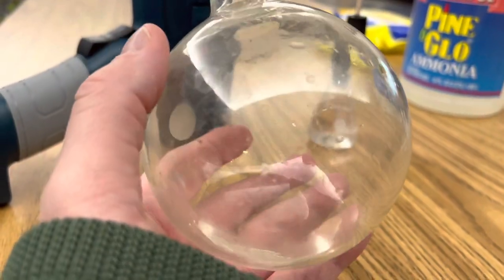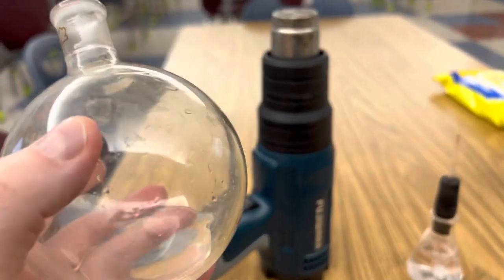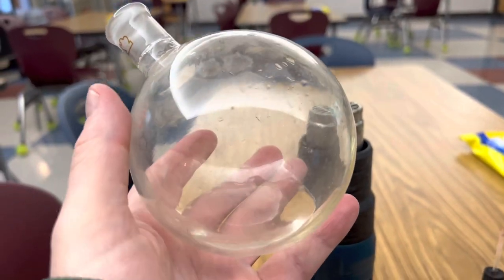The next step is to add a little bit of ammonia to your second flask and start to heat it over your heat source — whether it's a Bunsen burner, I'm going to use a heat gun — until you build up a lot of ammonia gas inside.